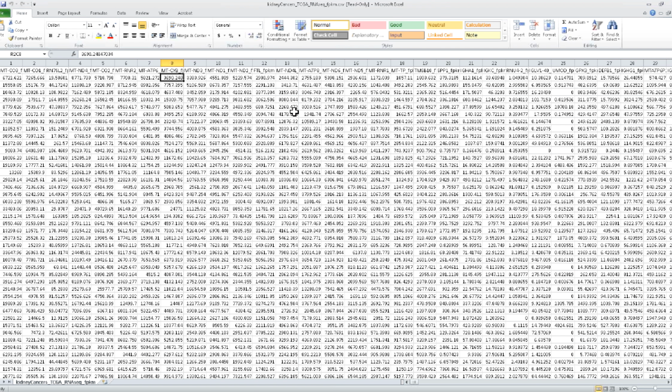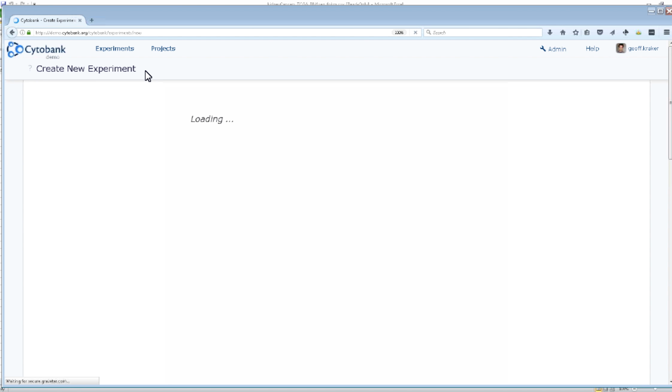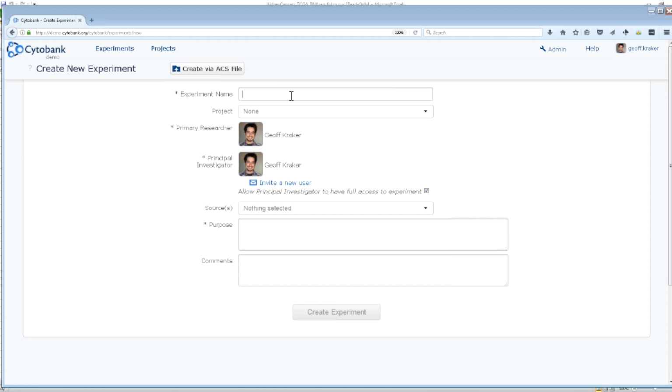So with that, I'll hop in and briefly show you what this looks like. If I wanted to make a new experiment, it's just like normal. You give it a name and a purpose, and then click Create Experiment.